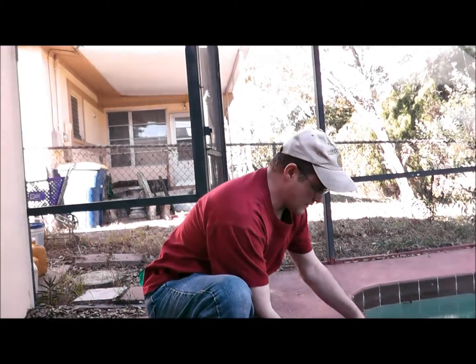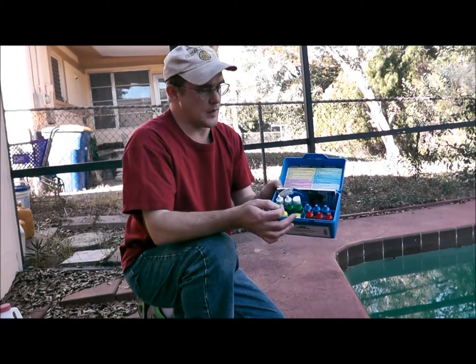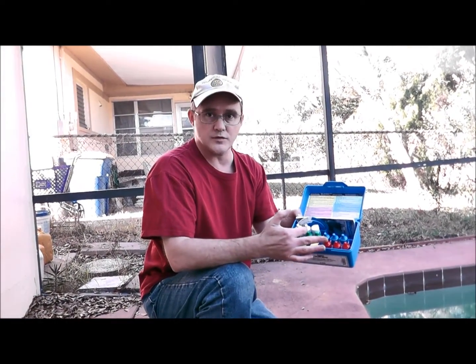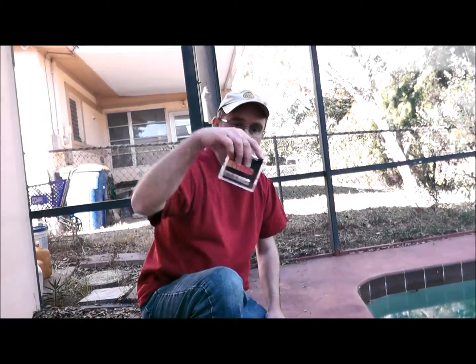I'm going to open it up now. For the alkalinity test, you're going to be using these three bottles. If you don't understand what's going on, up here it gives you the directions and they're color-coded. The first thing I'm going to do is take the vial.